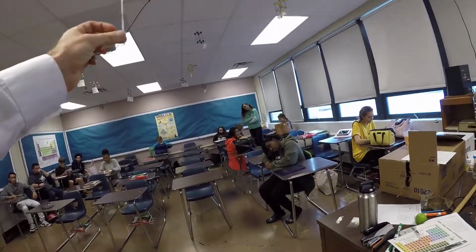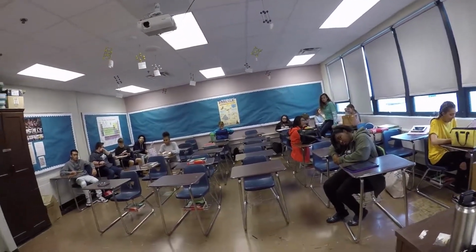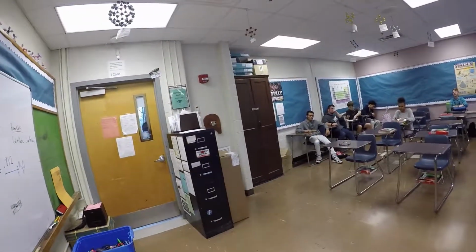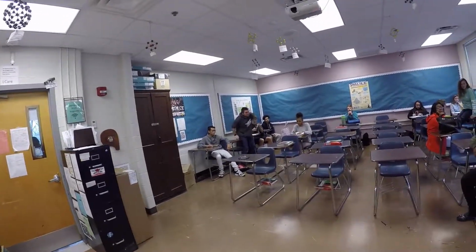Now this metal weighs around 0.49 grams. As I put it on the balance, you're going to put it on there. You need to measure out 25 centimeters. That's what the instructions say. 25 centimeters. Now this information comes from the periodic table.